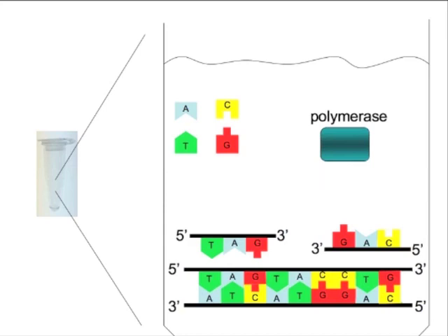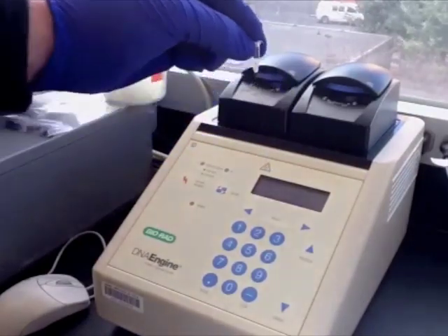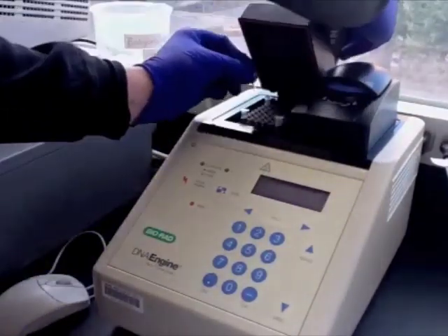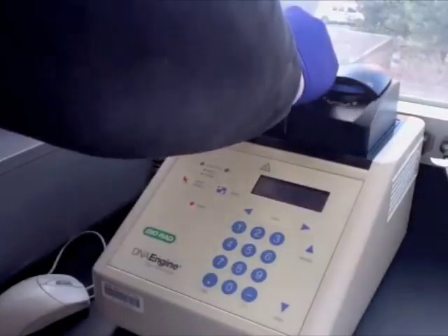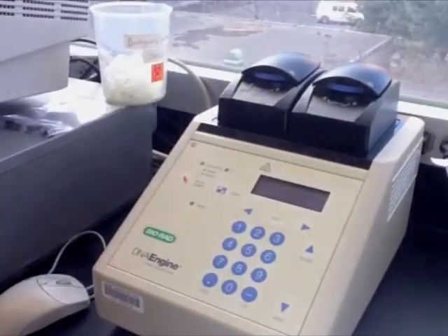Now we're ready to set up our reaction. Here we have our reaction in the tube and we're now putting it in this machine which is called a thermocycler. All the thermocycler does is change the temperature of the tube after a set amount of time. It's this temperature change that's going to allow the polymerase to do its work.